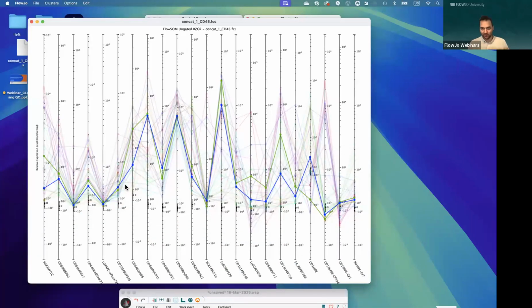That's why it gave you a low value that it can be overclustering. But in fact, they're much different. They have a difference in CD4. So that's why it wasn't a very low value or dark on the heat map. And also some differences in MHC class 2, etc. Yeah. So if you see a very low value or a very dark value, then you should investigate this pair of clusters and see if you should merge those two together.